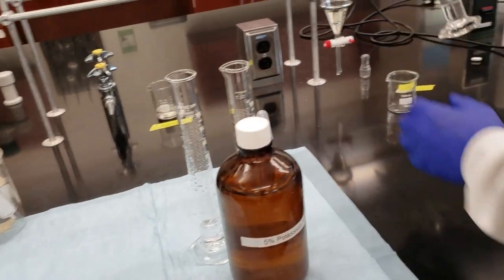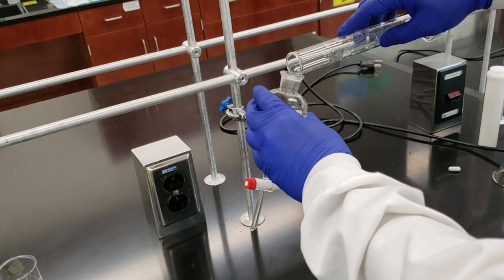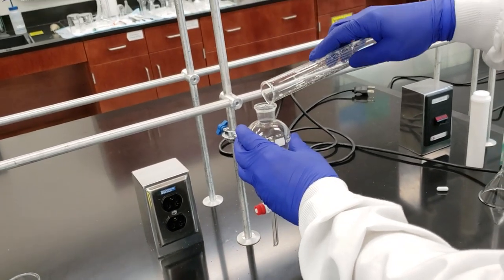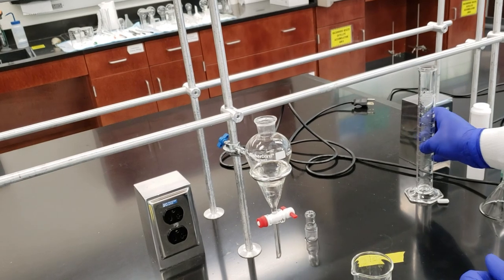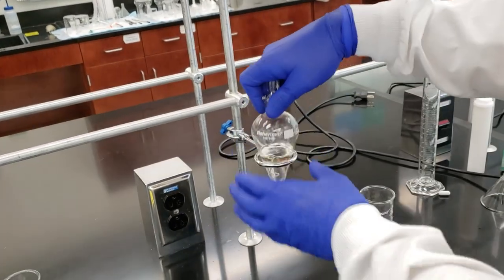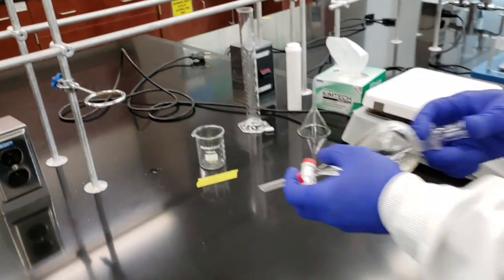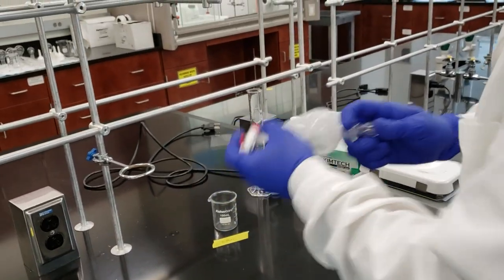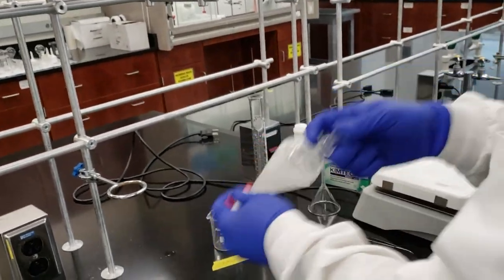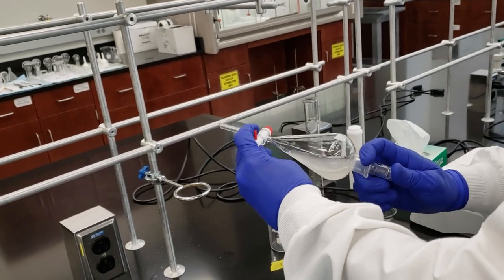Let me go ahead and pour this into our separatory funnel. Set this aside. I'm going to put my beaker here so I know that that's my ether beaker. And we'll go through our process here. Shake and vent three times.